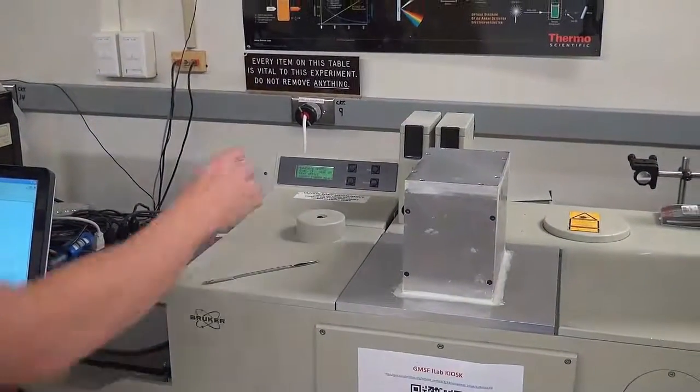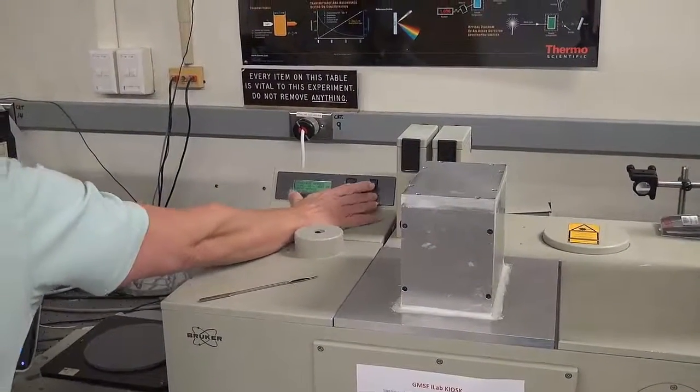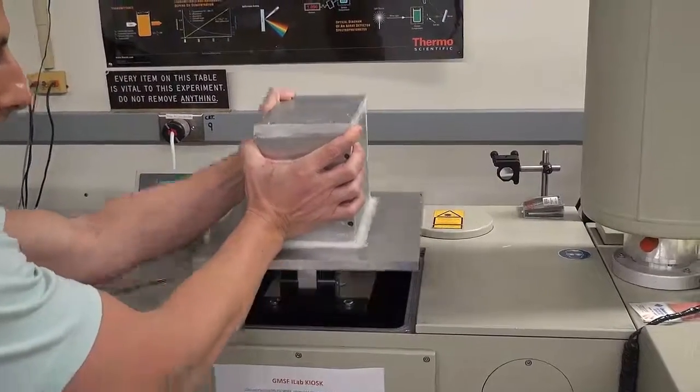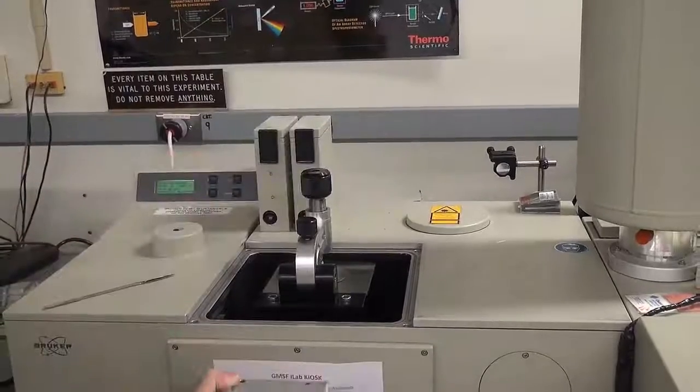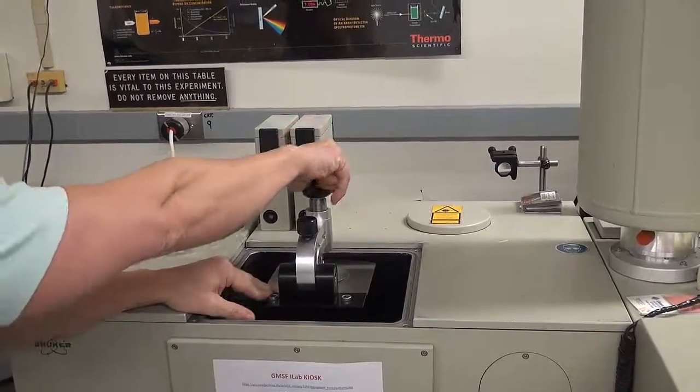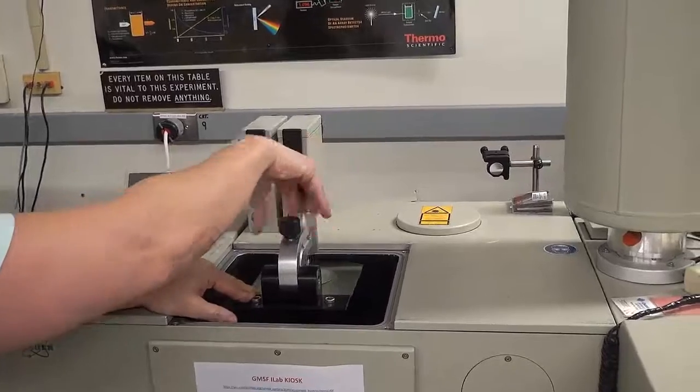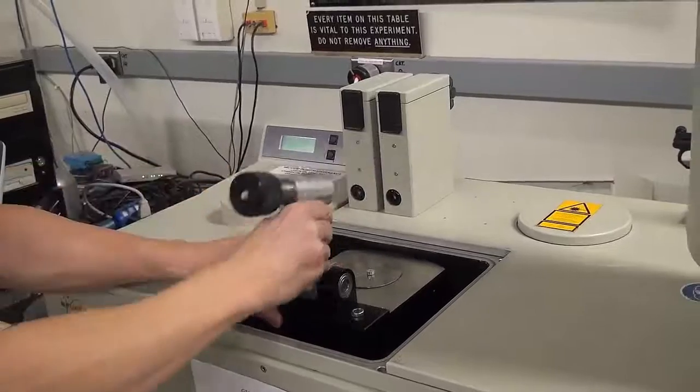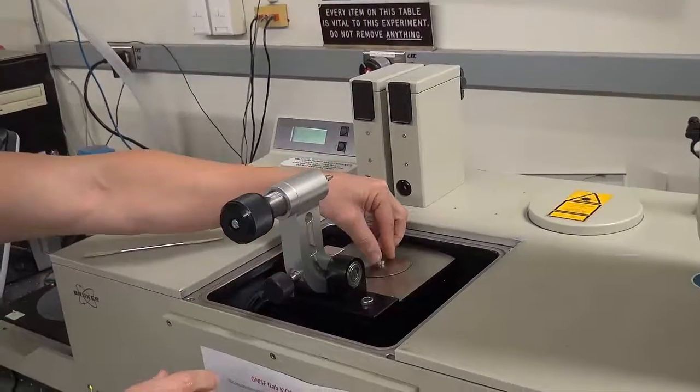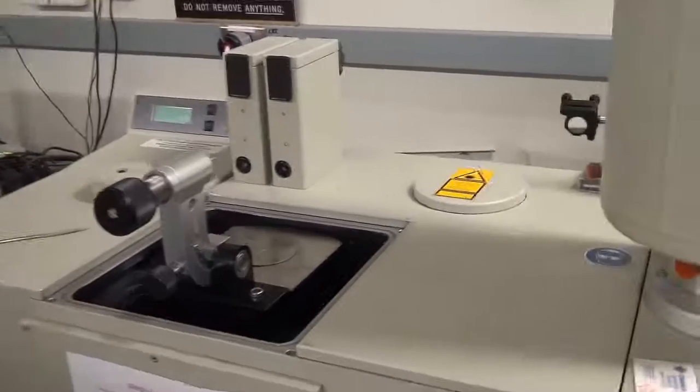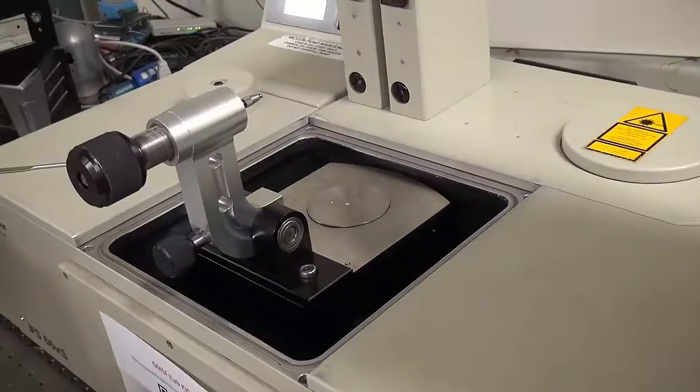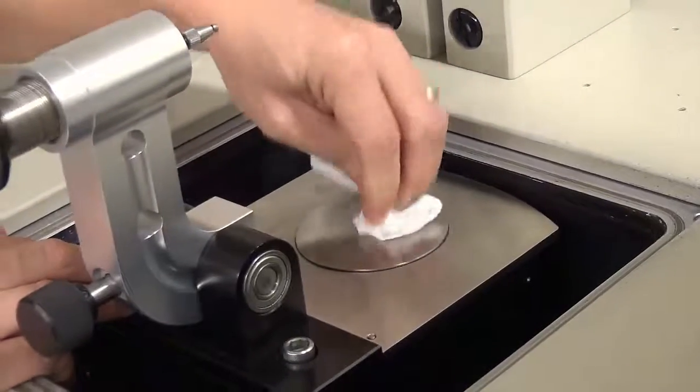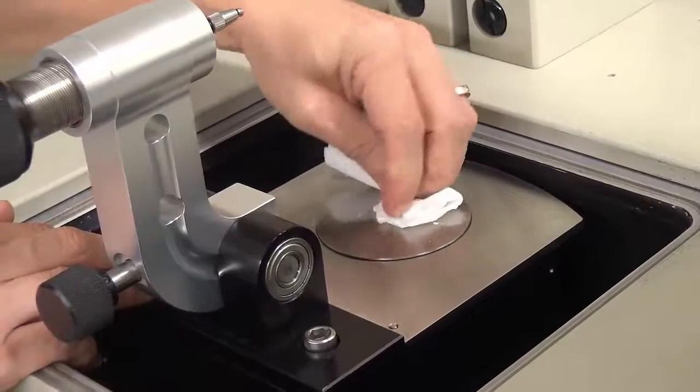So to switch your samples, vent the optics, remove the lid, loosen the big knob on the arm, then the small one, and then lift the arm while holding down the ATR. You can grab the puck and clean off the sample. The sample might stick to the diamond, so you can use chem wipes to clean it carefully, though most samples won't stick.